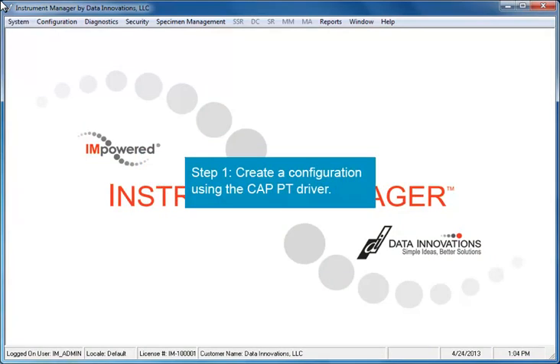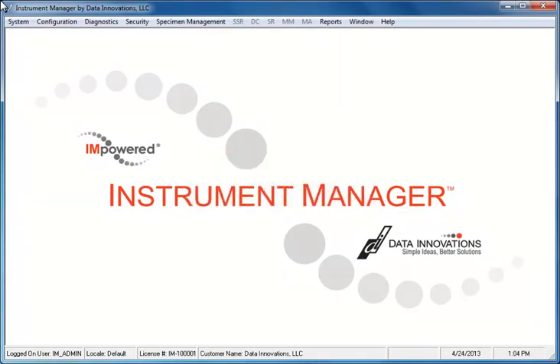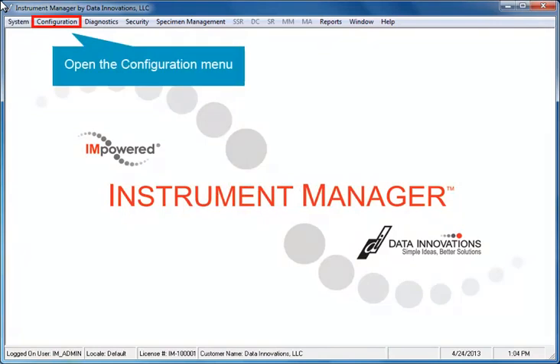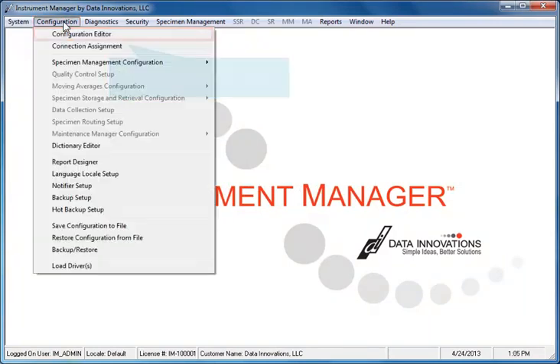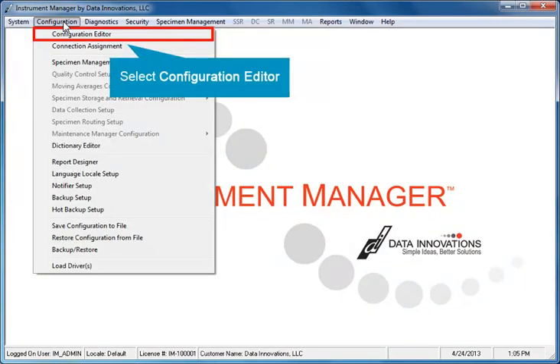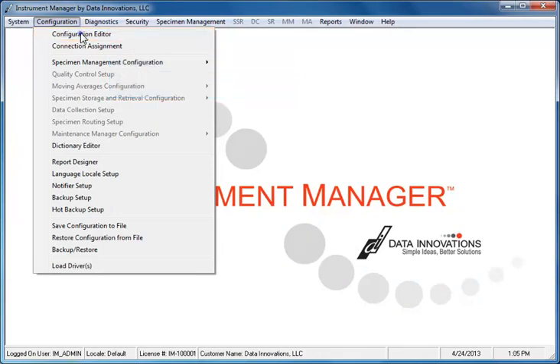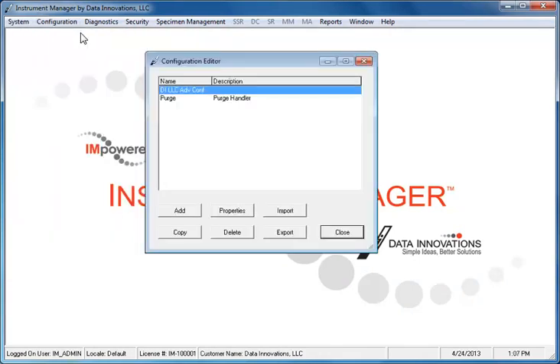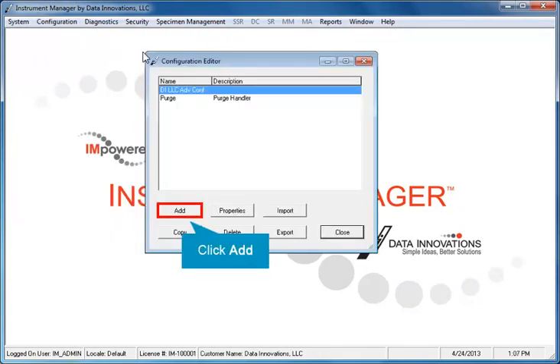The first step is to create a configuration using the CAP driver. To do this, open the Configuration menu and select Configuration Editor. In the Configuration Editor screen, click the Add button.